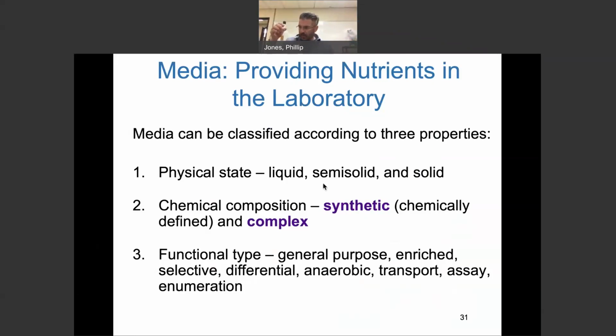Sorry, I have to go back. All right, so this was the initial broth. This is one I inoculated. I did this one on the 24th. So in 3 days it grew like this. All right, so this is called turbidity. You look, it's darker. Started out like that, now it's darker. So I know something was growing in there. When I shine light through there, it's going to be denser than this.